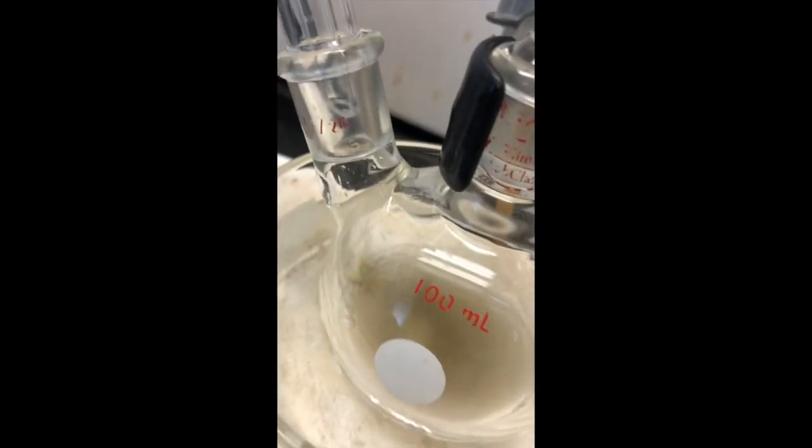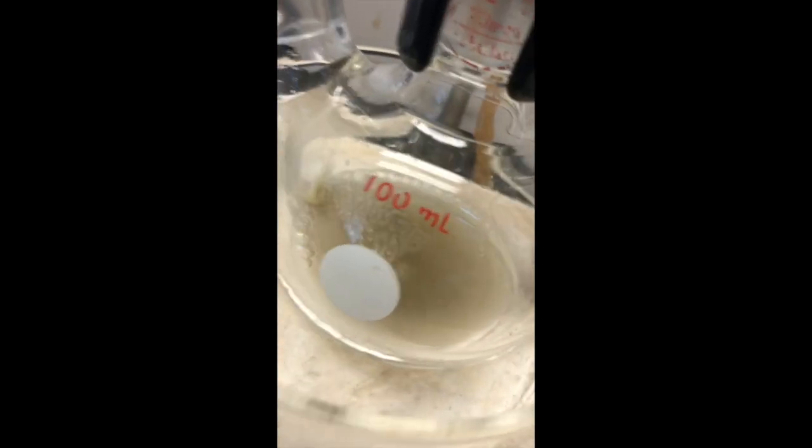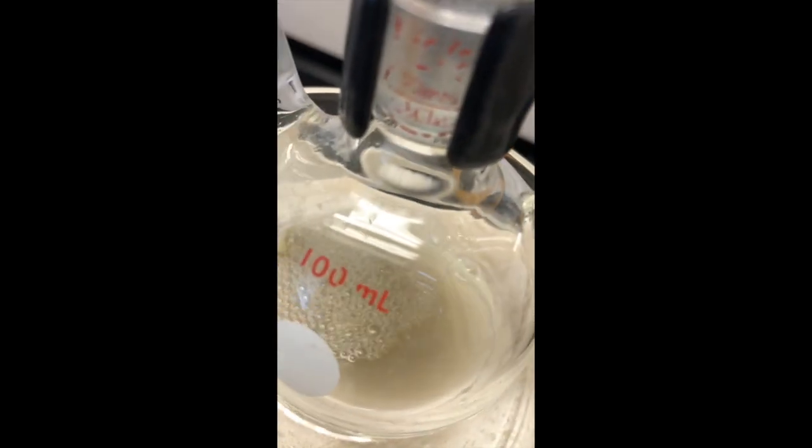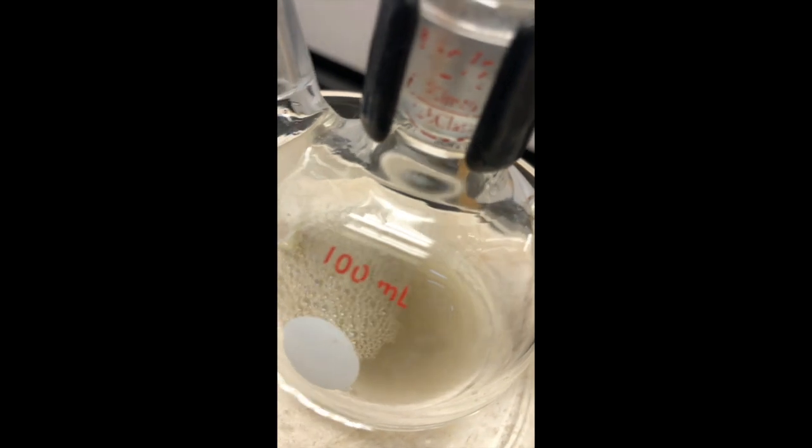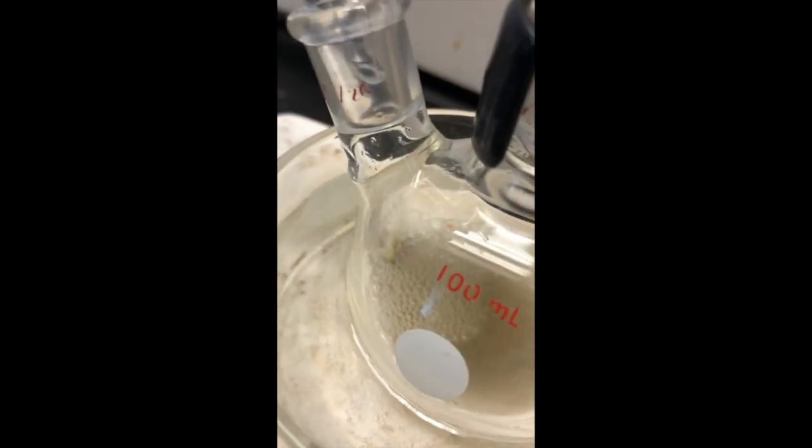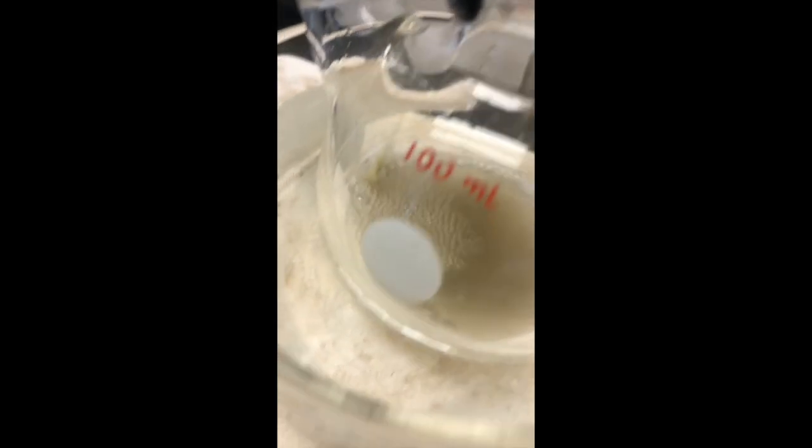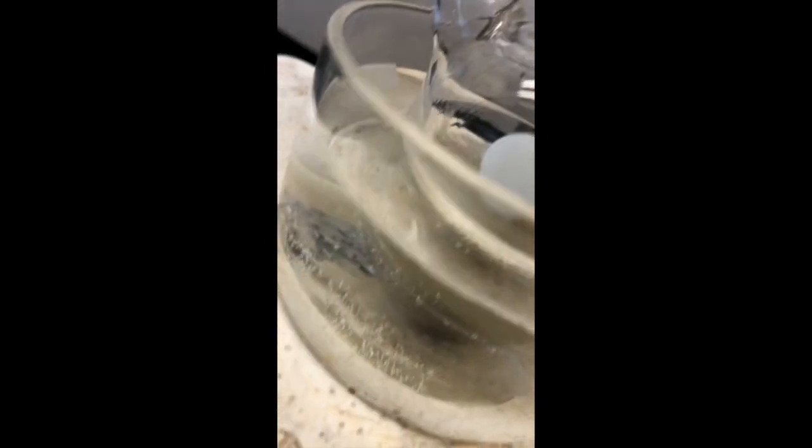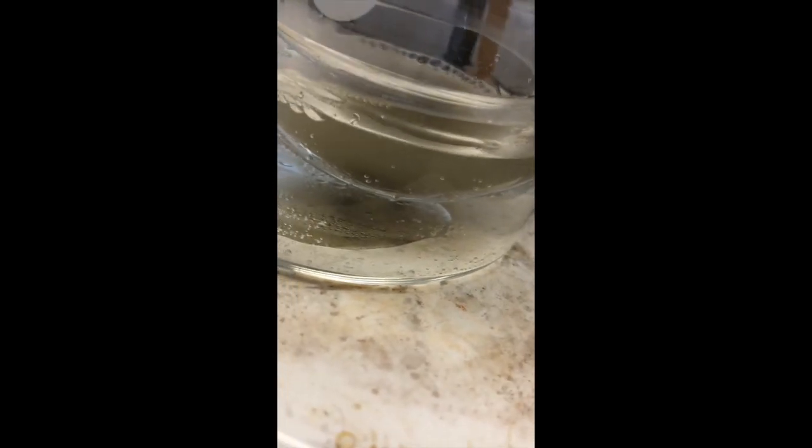If you look at that now, the stir bar seems to be moderately stuck. I turned it off and turned it back on again. So it's getting stuck in some sort of ooze at the bottom a little bit. But we have formation of quite a bit of now whitish solid that's happening there.